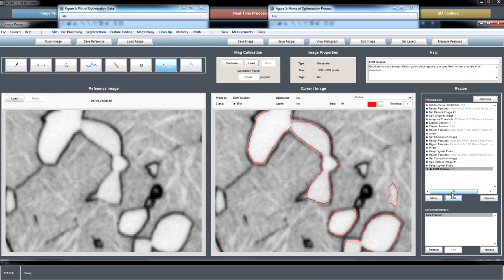We're just not sure if we want it to be drawn here or 3 pixels later.